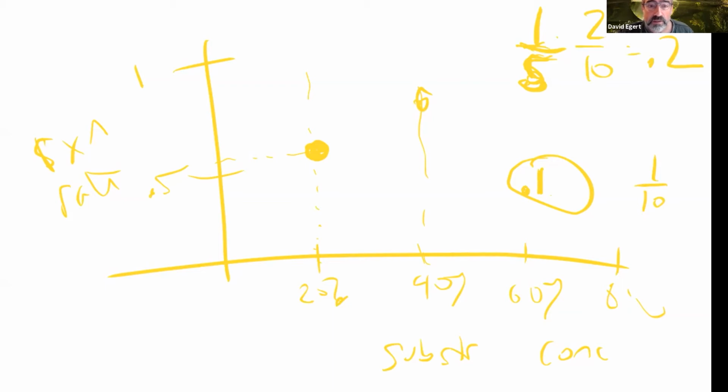So 1 out of 5 would be 20%. And the one that has 2 mils out of 5 would be 40%, for instance. So that's how we're doing that. So trial 1, trial 2, trial 3, trial 4, trial 5 is going to be just the pure 5 mils of just the hydrogen peroxide.